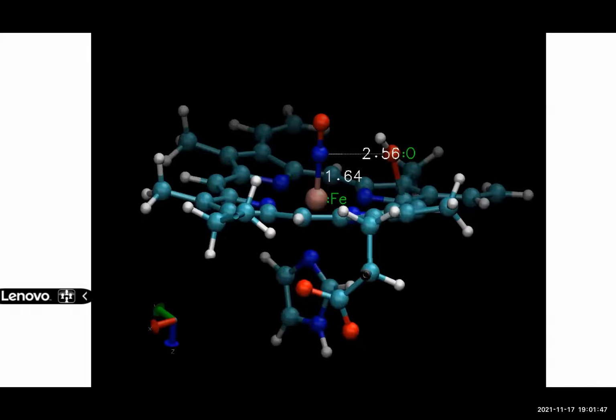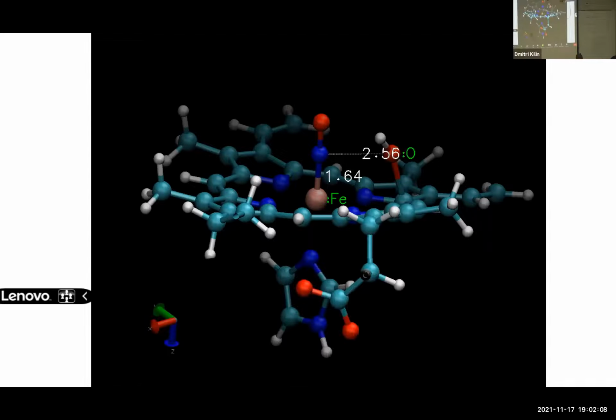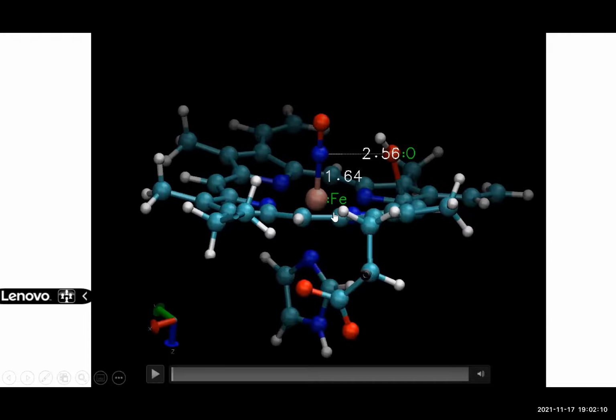Right? The word starts with the letter O. With letter O. So with your mouse, can you please focus on and show the iron, and now show all nitrogens that are close to it. Here. Second, what else? Third, fourth, fifth. The one from the bottom. Yeah, 6.